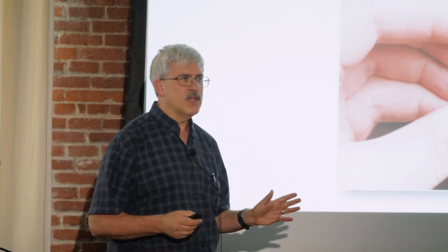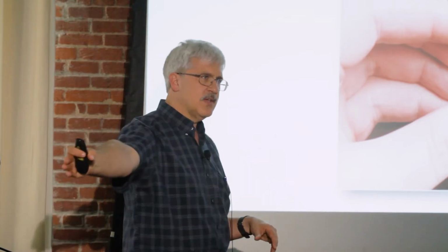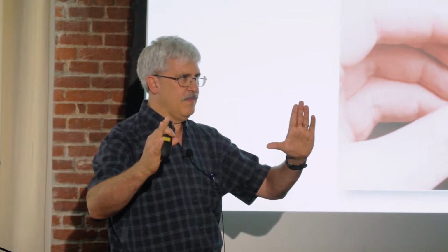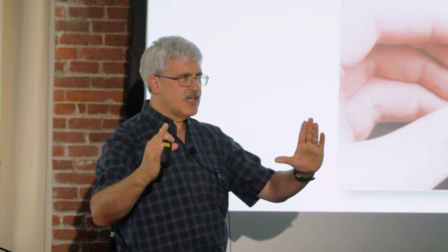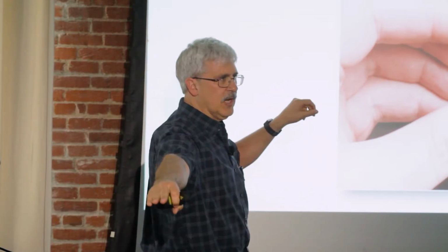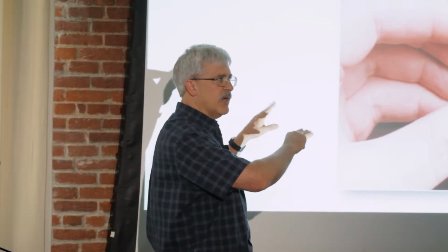So what you're really going to do is put your sample on, get everything set up, send the light to the computer, and you're going to see your image live. So you get the image live, you focus on the screen, and then you turn back to your oculars and adjust the oculars to match the screen, because the screen's what matters. That's the picture. What you see through the eyepieces is irrelevant.